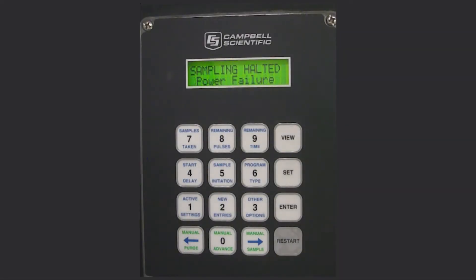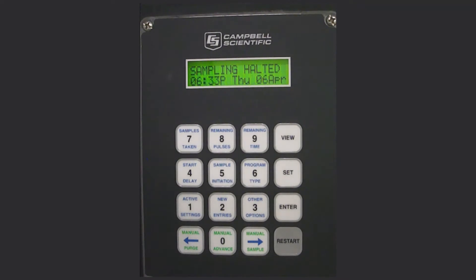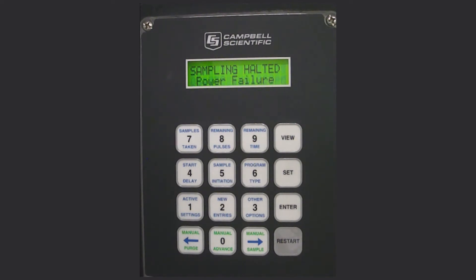Hi, I'm Ron Goodrich with Campbell Scientific. Today I'm going to walk through programming Campbell Scientific's Vacuum Sampler 16-Touch Keypad Controller for a 4 to 20 milliamp input with a time step programming sequence.